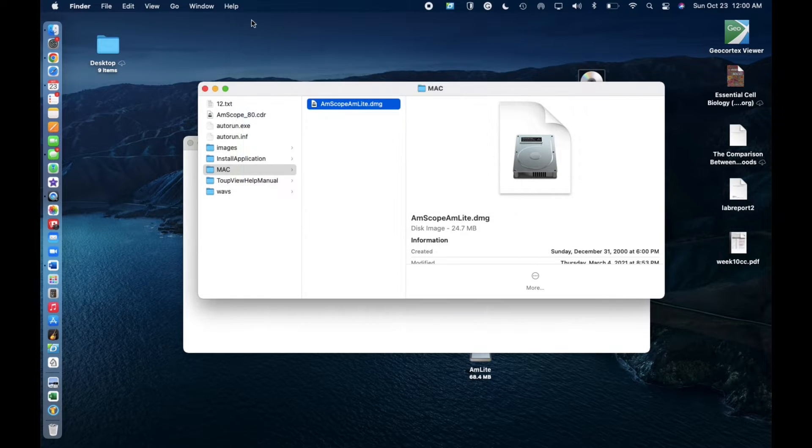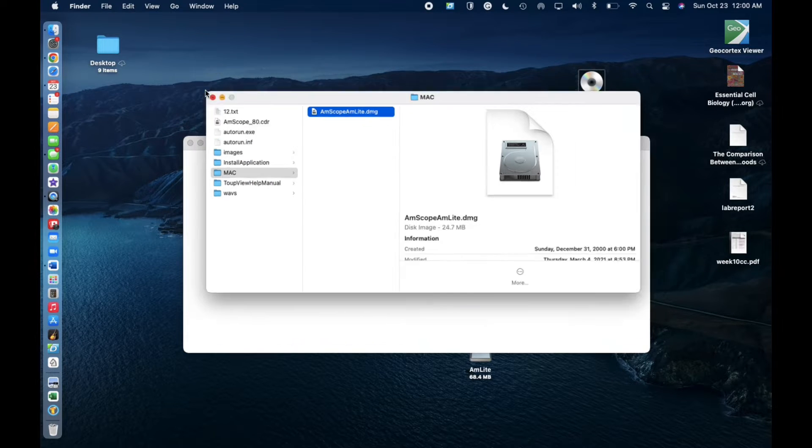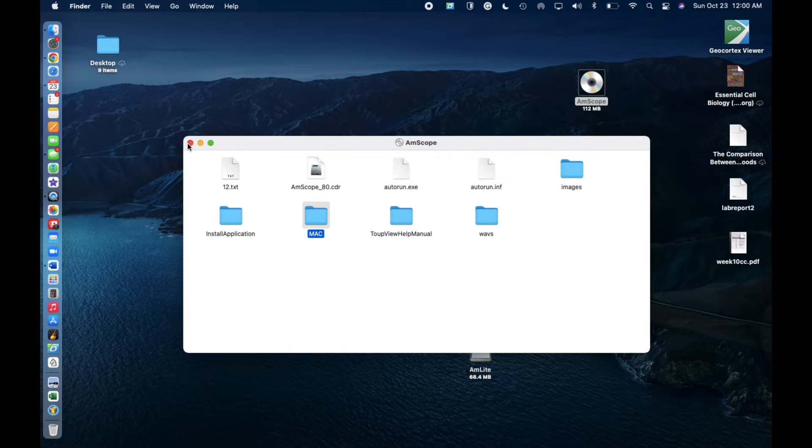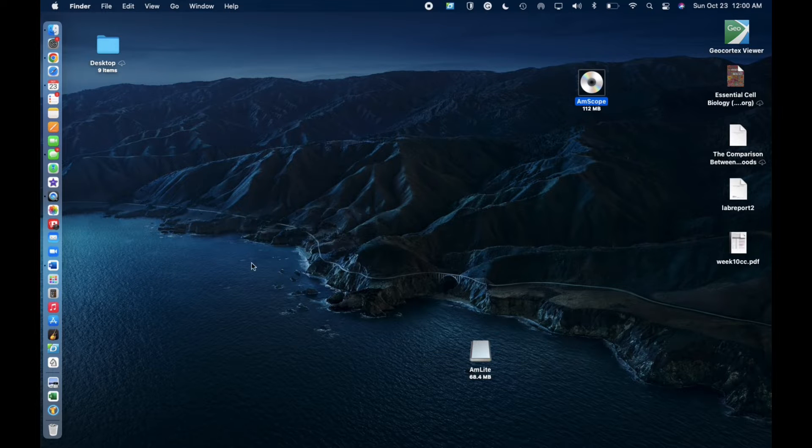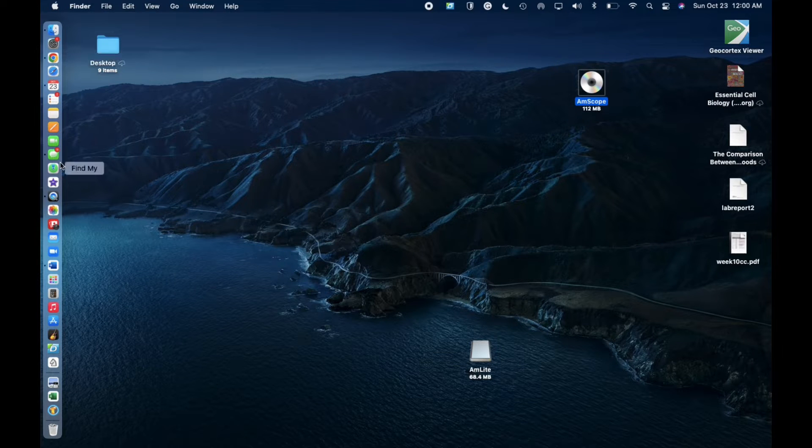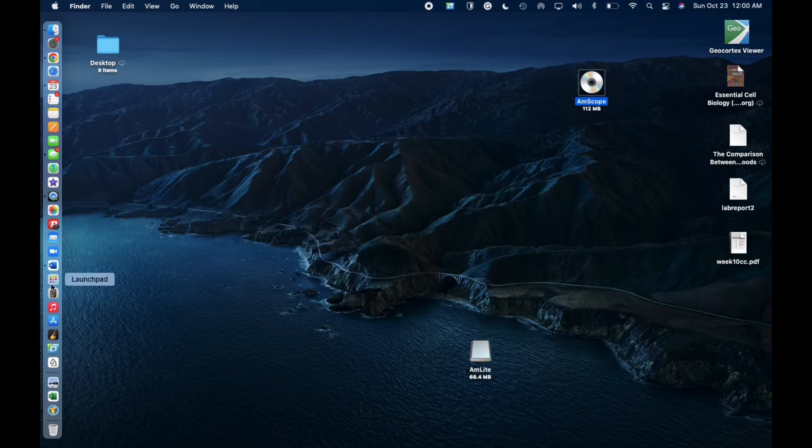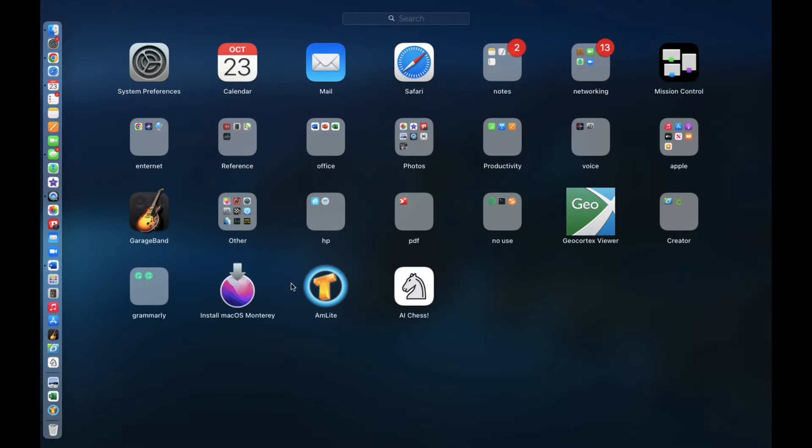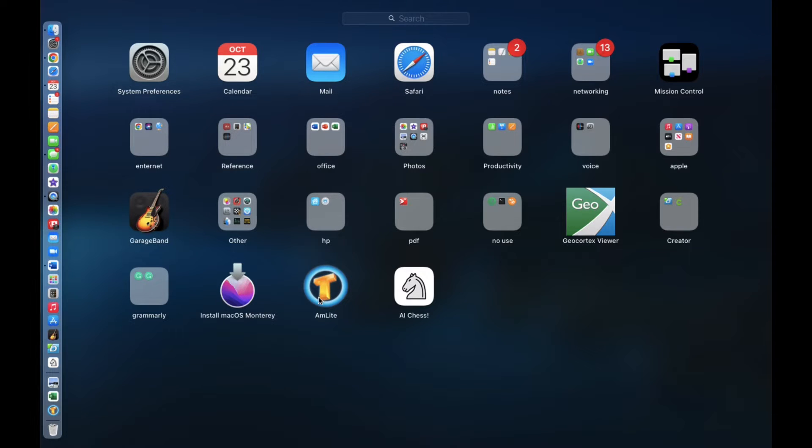Okay, so we've completed that and then you'll have an application that'll pop up. You can either go in your launch pad and it'll be right here or I already have mine dragged over here.